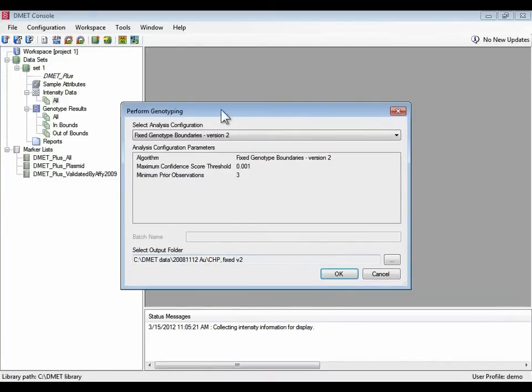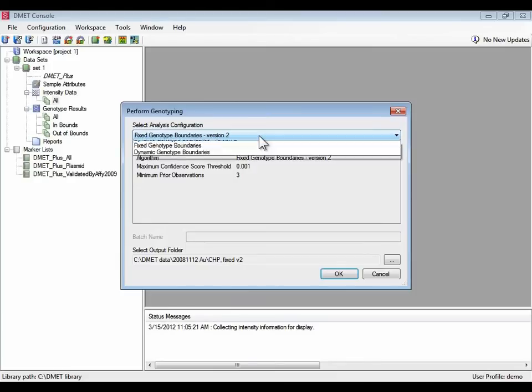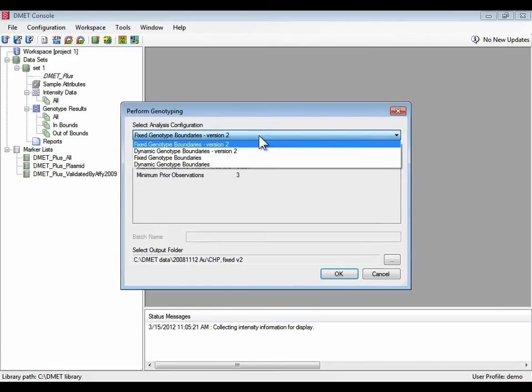Okay, so here's the main genotyping window. You start by selecting how you want to genotype your data, your analysis configuration. From this pull down window, there's four options available.